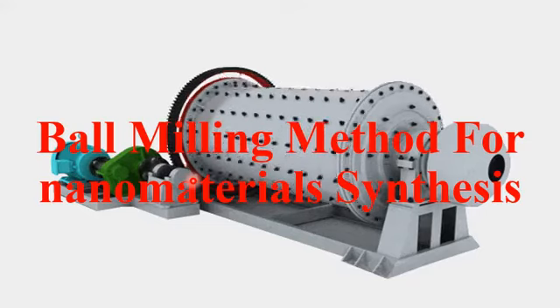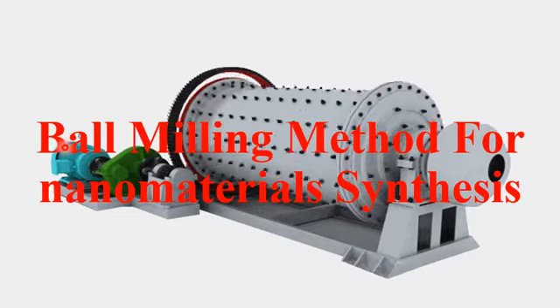Dear student, what do you think the term ball milling means? In ball milling we use a ball mill, which is a type of classical grinder. So basically the ball mill crushes a material in the form of bulk.